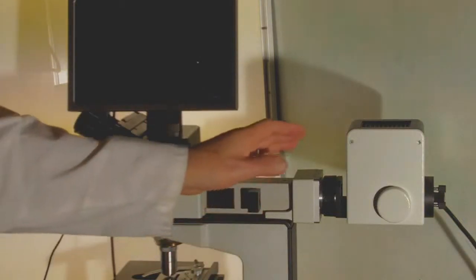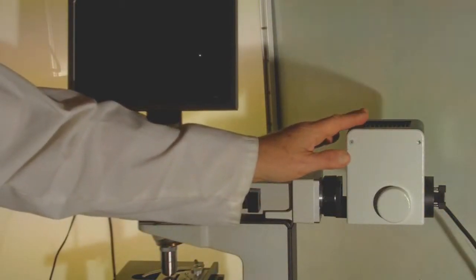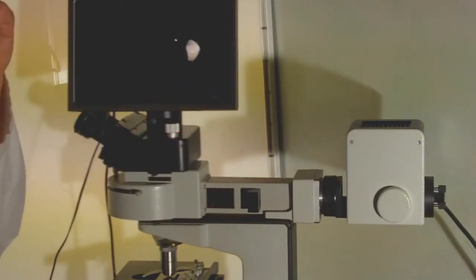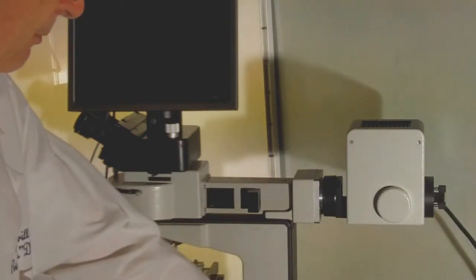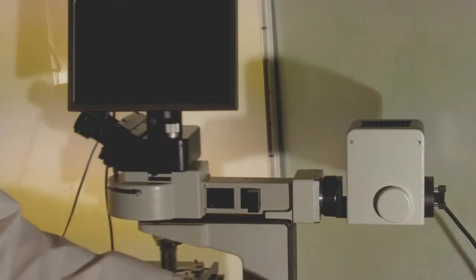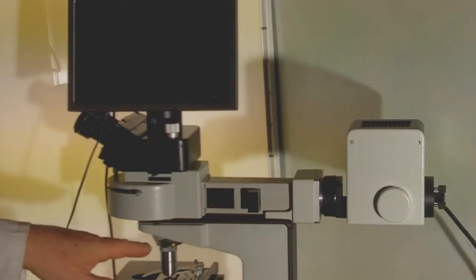For more than 50 years, the standard light source for a fluorescence microscope has been the mercury arc lamp. In the old days of fluorescence microscopy, the light was down below and brought in through a substage dark field condenser to achieve dark field fluorescence.